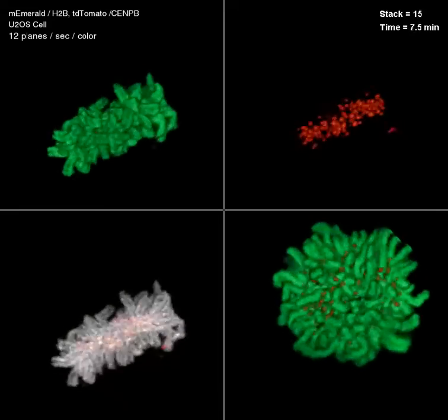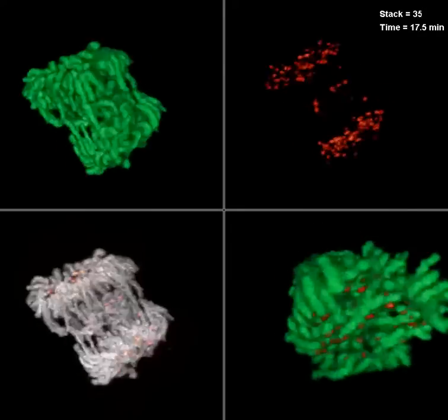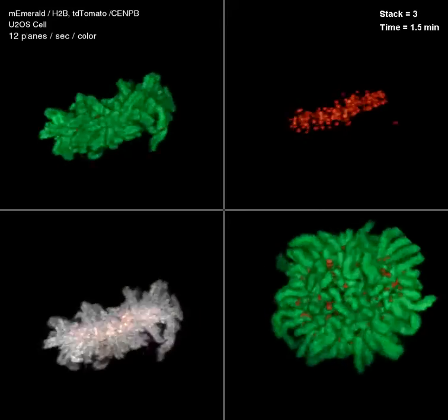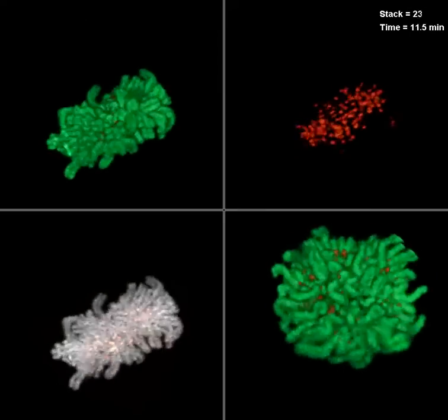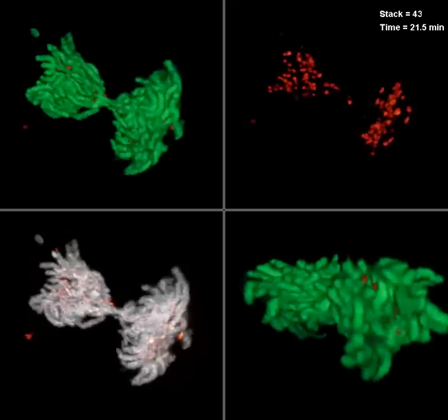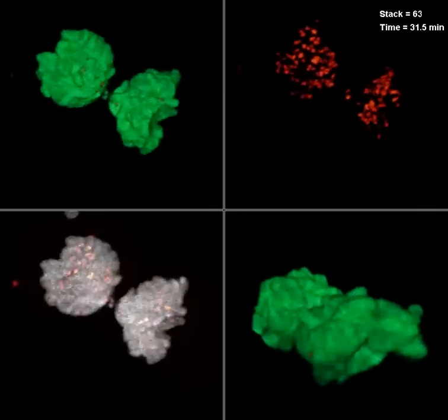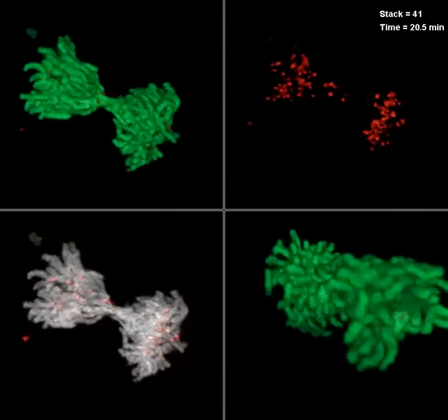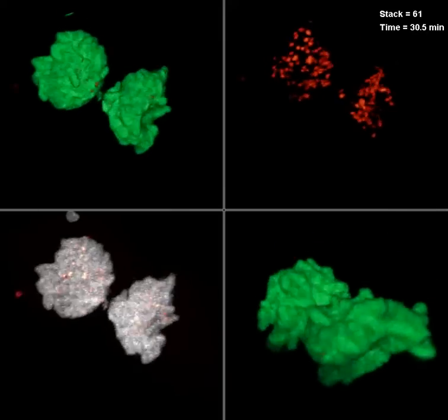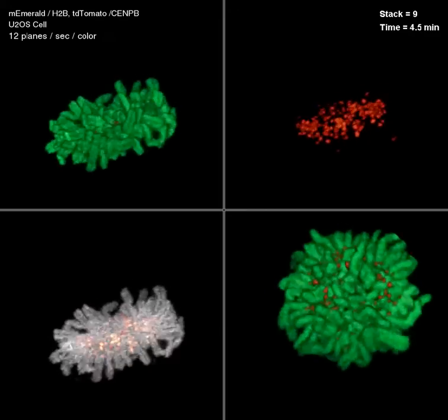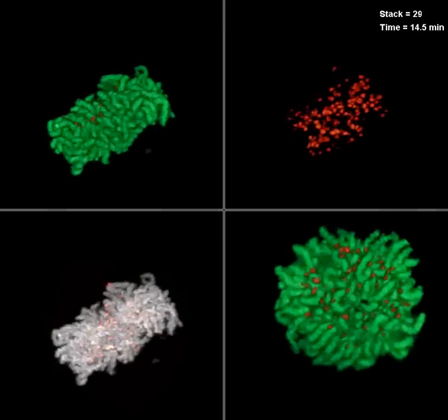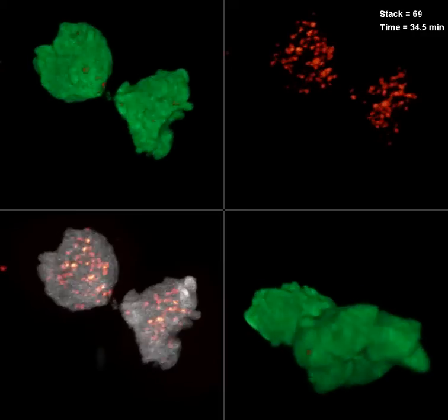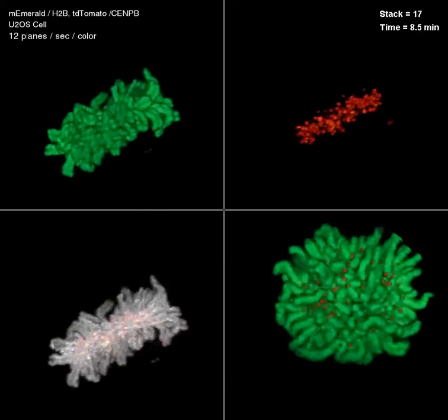So oftentimes, if people do amniocentesis or something like this to look for chromosome abnormalities, they have to basically take a cell which is dividing and then blow it up and then look at the pieces on a cover slip. But here, for the first time, we're able to see with sufficient X, Y, Z, and T detail, identify all of the chromosomes in a living cell and furthermore see how they evolve at all points as the cell divides.